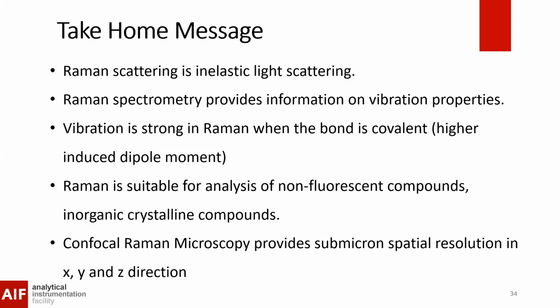Raman is very good for analysis of non-fluorescent compounds and inorganic crystal compounds. And Confocal Raman Microscopy can provide submicron spatial resolution in the X, Y, and Z directions. All right, with that, I'd like to take some of your questions.